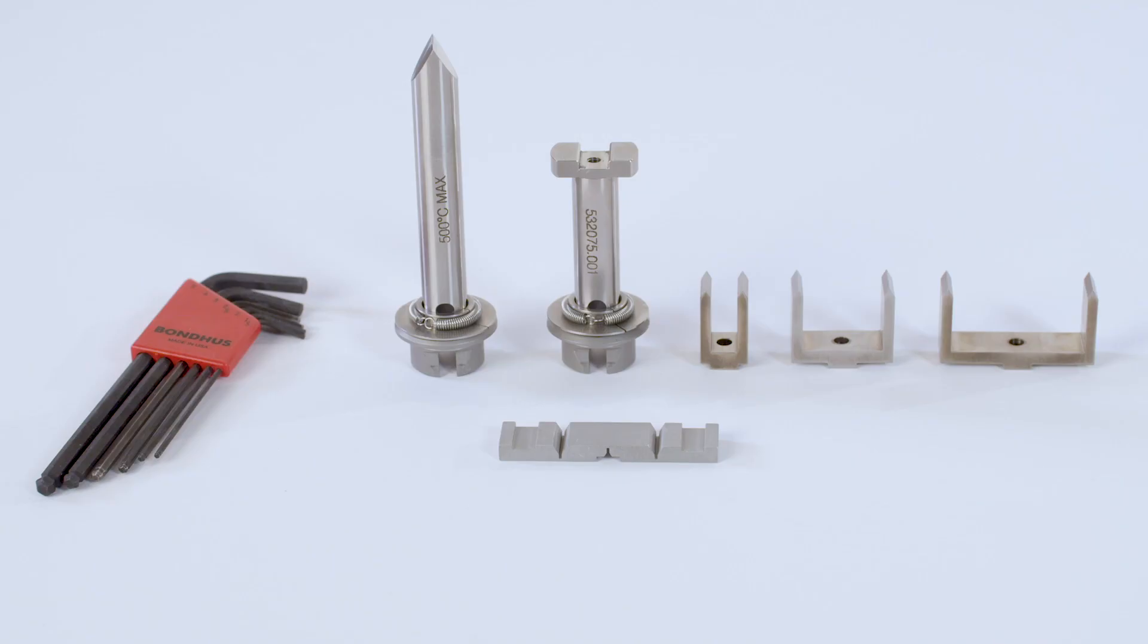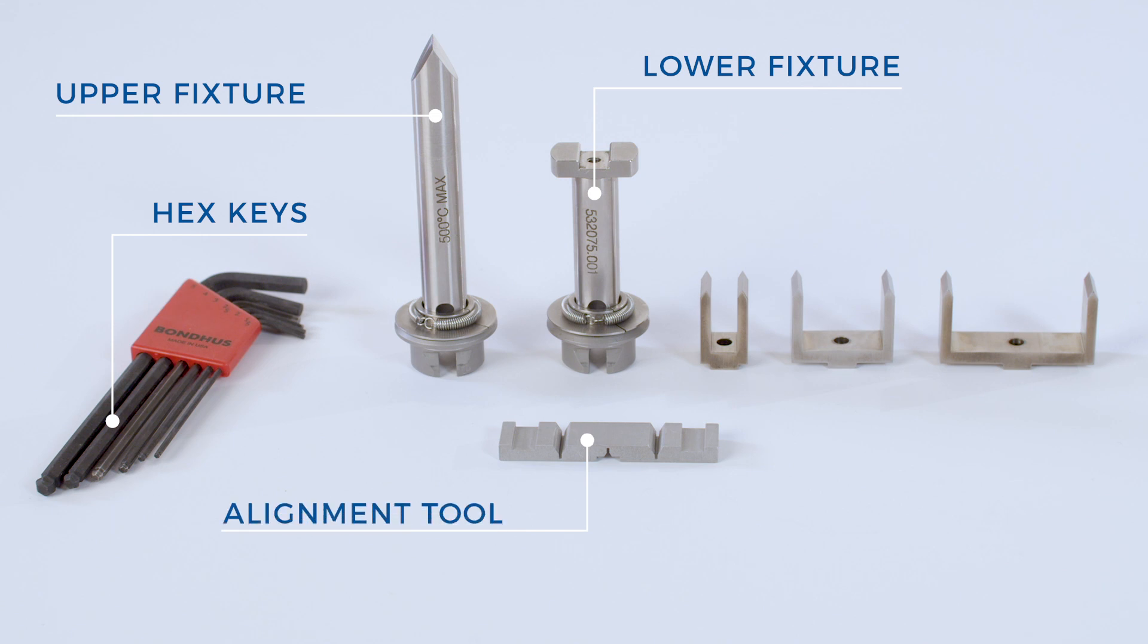The three-point bending clamp kit includes a set of hex keys, the upper and lower fixtures, one alignment tool, and 10, 25, and 40 millimeter size frames.